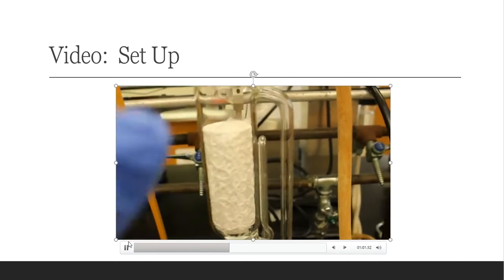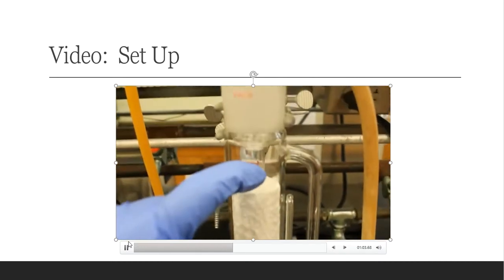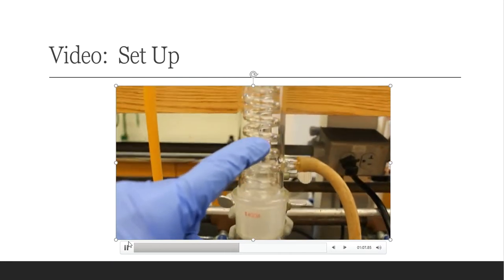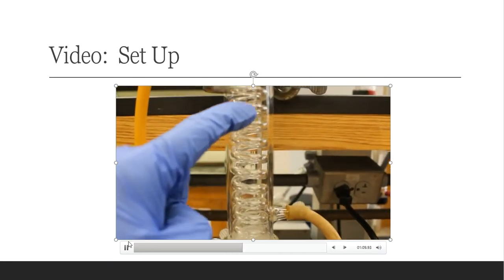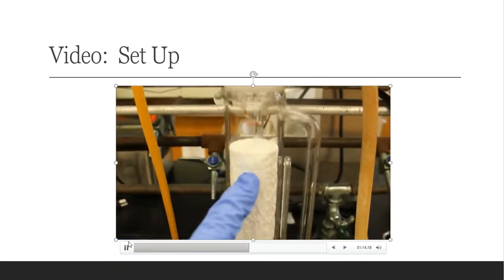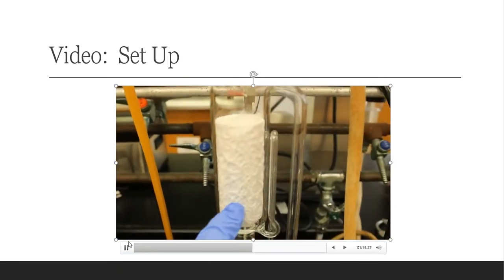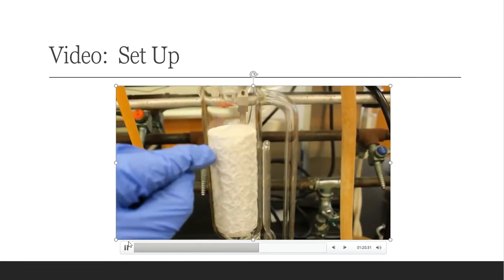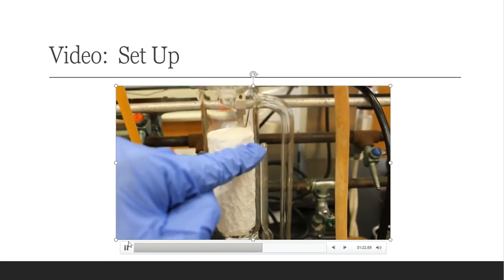And the ether, if it gets too hot, will try to escape, and it will go up into this part of the Soxhlet, which will hit a cold condenser. So this condenser will help send my ether back down into the Soxhlet, which is right here. This will slowly fill more and more until it gets to the top of that neck.